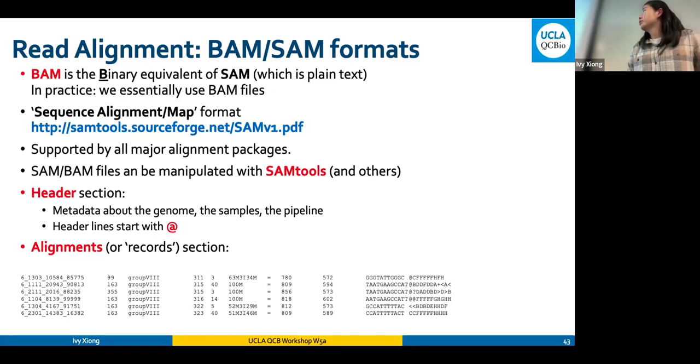And you don't really have to get into the details that much, because in practice, you seldom open up individual SAM or BAM files to see what is stored in there. Rather, you use software to handle it for you. Just make sure that you know what parameters you're using. But sometimes it might be good to check if you really want to get into specific problems, and you want to know what is actually in the SAM file or the BAM file.